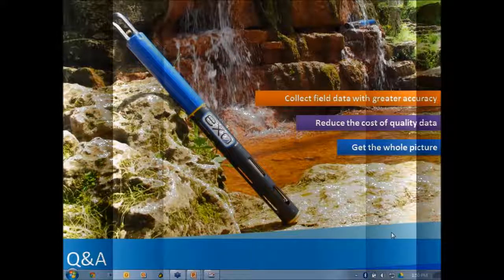The chlorophyll sensor was flatlined, and we were having huge algae blooms. And that's because those algae blooms were primarily cyanobacteria, and we picked those up. And the vice versa can be true as well. You can have algae blooms from phytoplankton that aren't cyanobacteria, and that would be detected on the chlorophyll sensor. So if you're interested in monitoring algae, we really feel it's very important to measure both of those channels so that you get a very good estimate of the total algae biomass.